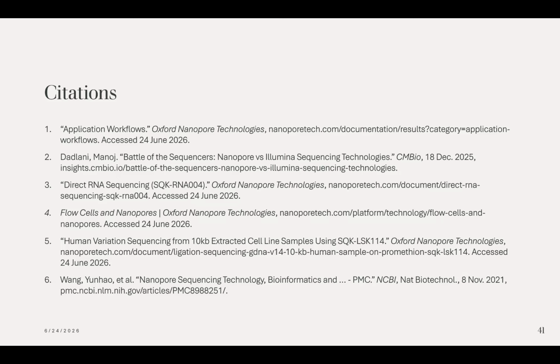But then again, you can reuse your flow cells several times over. So each sequencing run is not nearly that cost. But I think for the output that you expect from each run, I've found that it's extremely worthwhile. But I'm sorry, I can't really give a fair comparison since I haven't done the sending out for others to sequence for me. Okay, thank you. Sure.